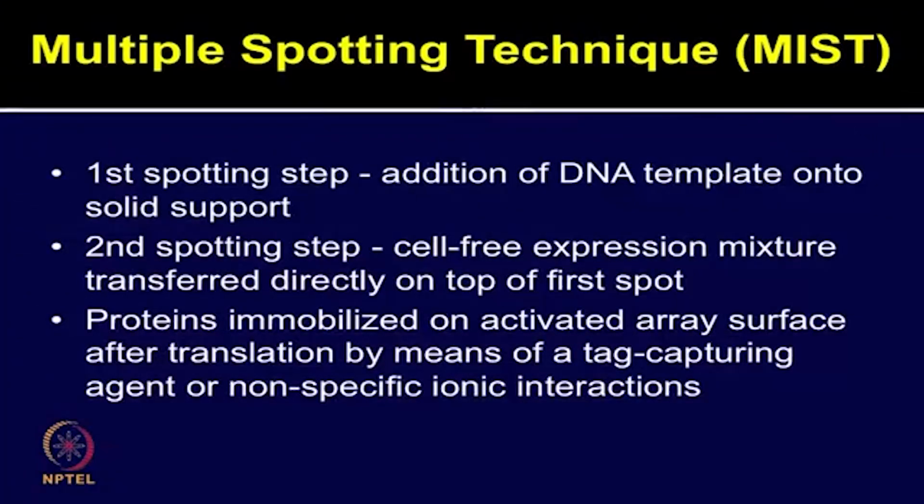Today we will talk about the multiple spotting technique. This is another approach which facilitates generation of high density protein microarrays by using a cell-free expression system. In the MIST approach, both DNA and the cell-free expression system are printed on the chip surface. Two rounds of spotting are performed.